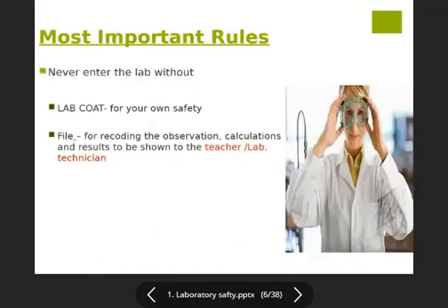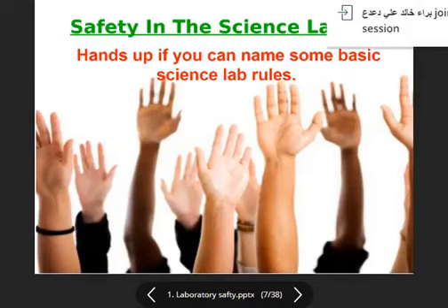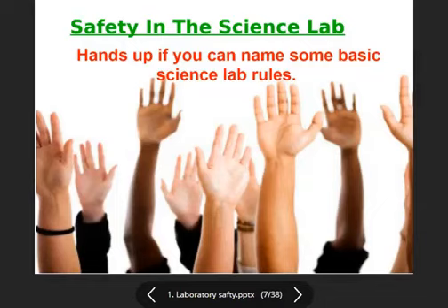The most important thing you should remember is the lab coat. You should not forget to wear a lab coat. Lab coat is a must in the lab because there are many chemicals and acids, and these can drop over your clothes, and your clothes can be dirty. So it is very important. When you come in the lab, as I told you, this is not a playground. So if you have any problem, just raise your hand, and I will try to answer all of your questions, whatever arise.